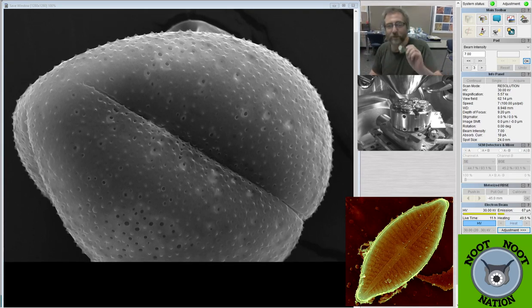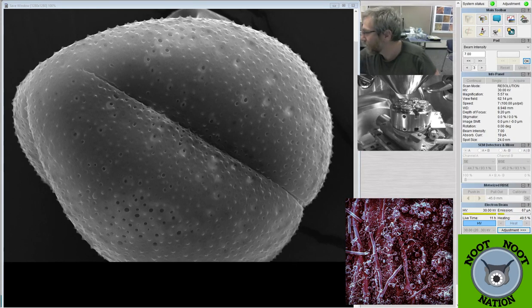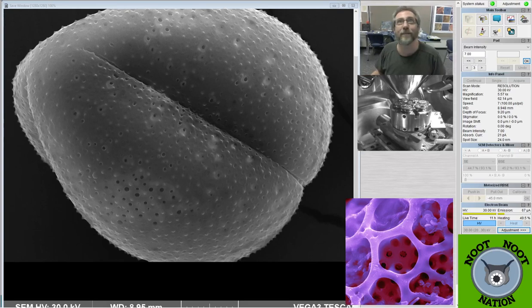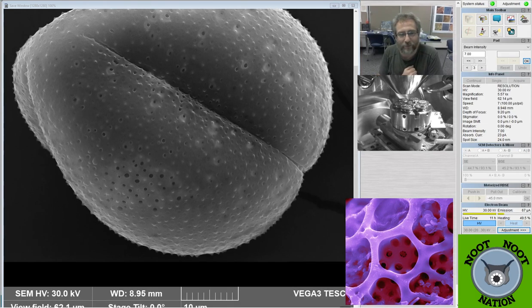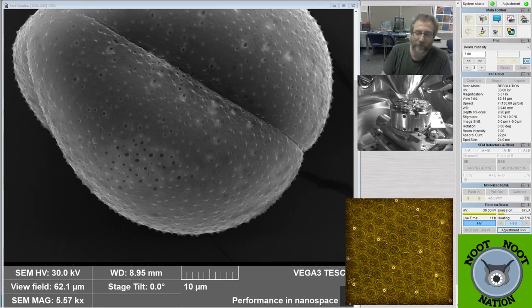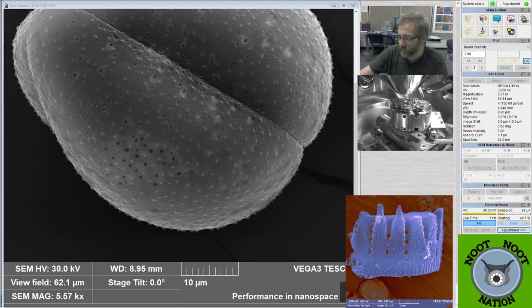Oh crap. Strawberry. You know what? That reminds me. I collected some strawberry. I didn't put it on the SEM though. I forgot it was in there. Crap. Well, maybe I'll try to mount some when we finish, if we get all the way through 7. This is number 5. So I only have 2 more stubs that we haven't looked at yet. And if we do another one, I might just mount it live and try to put it on there. I don't know. We'll see. Might be too much. But I did collect some strawberry flowers. We have a bunch of strawberries in our yard that just grow there. So, you know, they're eternal. But they still make sexy bits.